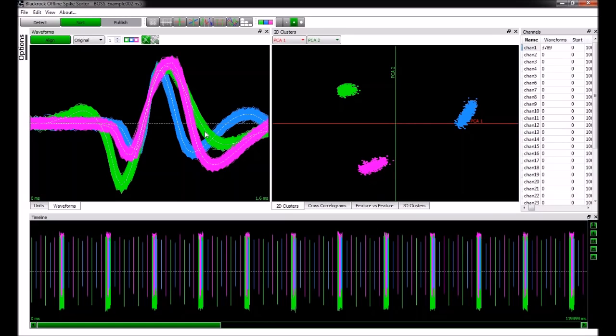I've had my laptop die on me while doing spike sorting before, and BOSS had saved some session data in the background, which is definitely useful. This has really happened.